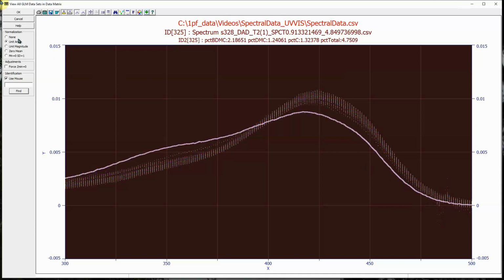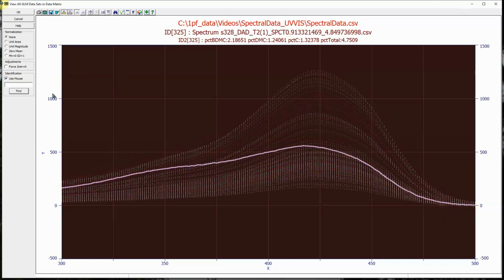We're now going to set the normalization to none to see if we can identify a wavelength or set of wavelengths that generally track the overall curcuminoids that we wish to model. Now this is very important, for there may be one or more UV or visible wavelengths that have a simple and direct correlation with the target analytic variable. This is an example of a modeling problem that is elementary for liquid UV vis spectra and a true unscramble nightmare for doing powder NIR spectra.